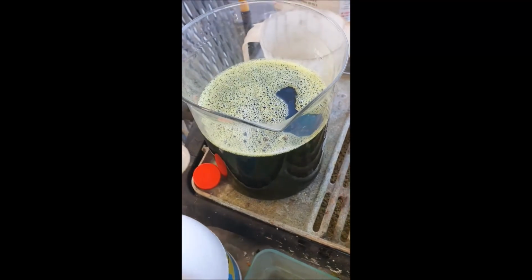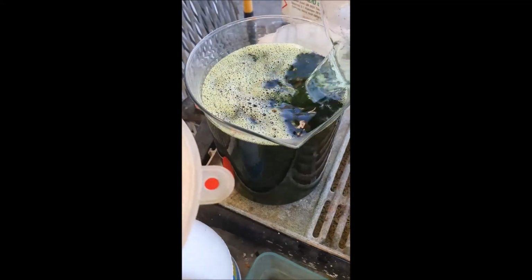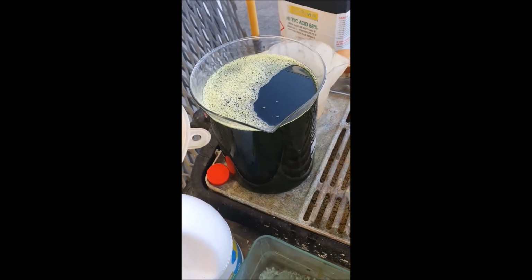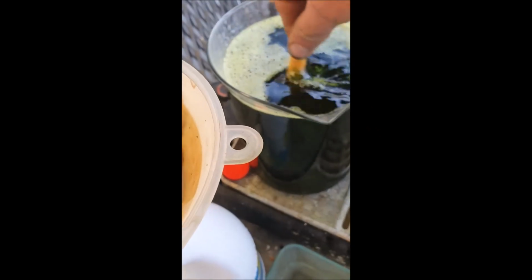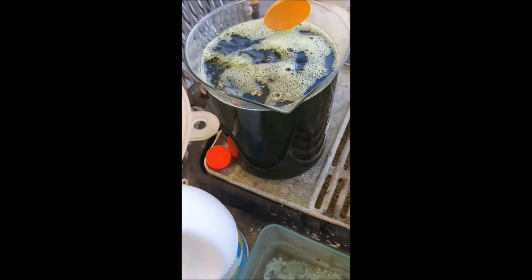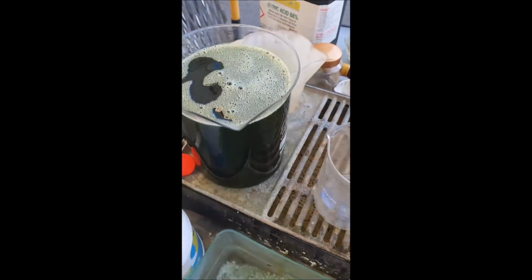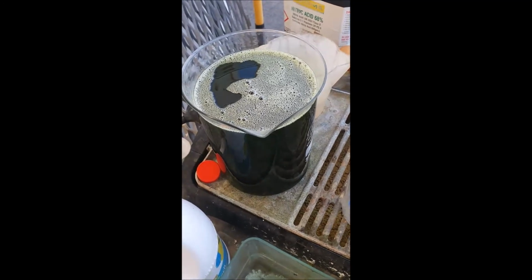Cross your fingers, guys. I don't want to look like an idiot on camera. Here we go. So let's roll this in. Now, the waiting game. Let's see if it drops. I'll give it a bit of a stir, and we'll come back later and see if it's worked. I was told that the second I put that stuff in there, I'm able to test, but I just want to give it a few minutes, and we'll come back and test to see if there's any gold still in solution.